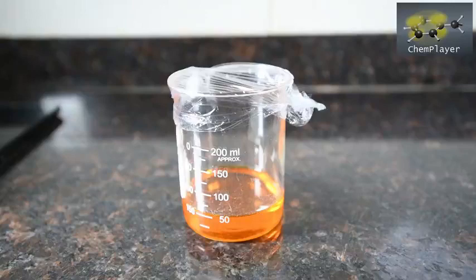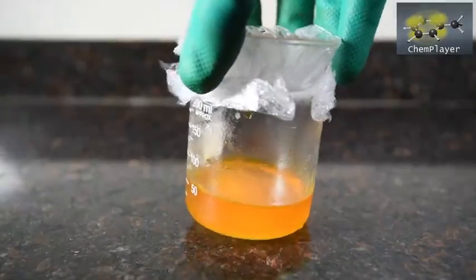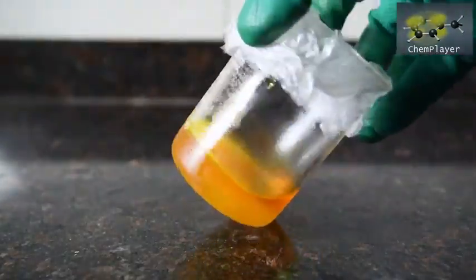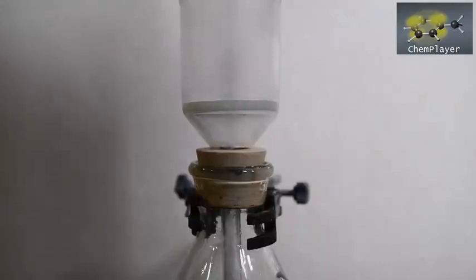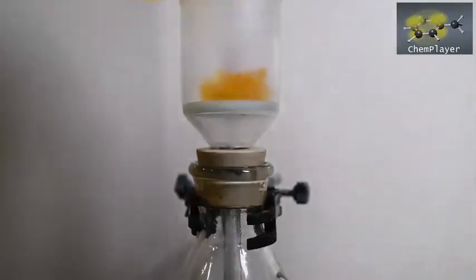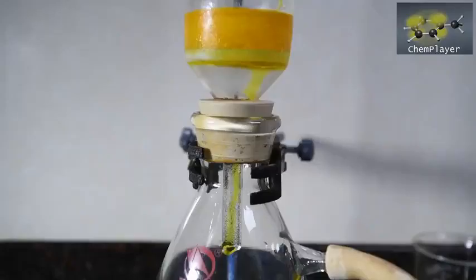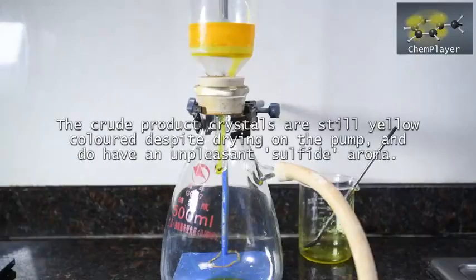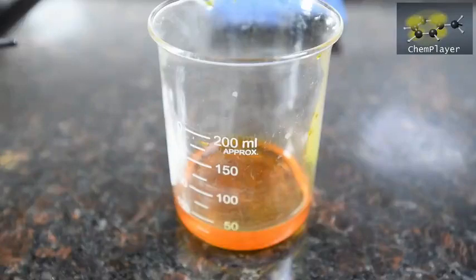I guess we got lucky because apparently this can be hard to crystallize, but we've got a beaker full of crystals here after just a few hours of chilling. That second filtration took about 40 minutes believe it or not — pretty slow with the viscosity — but we've got the crystals out and we've saved the filtrate.